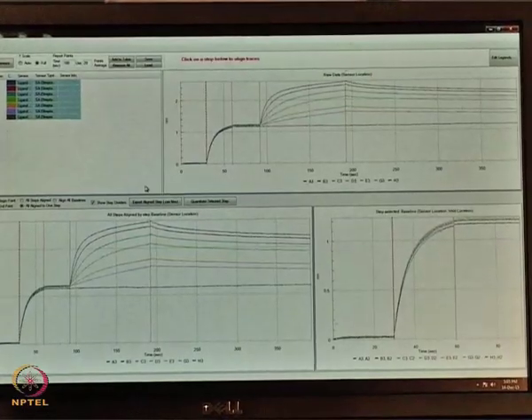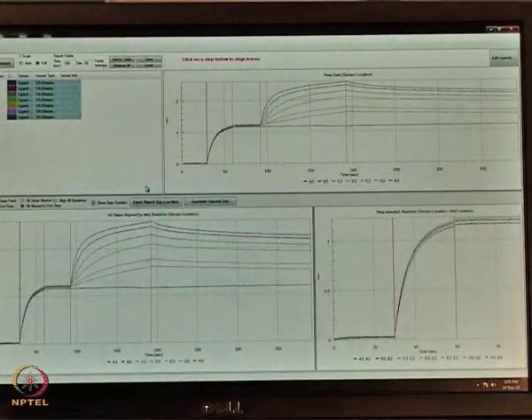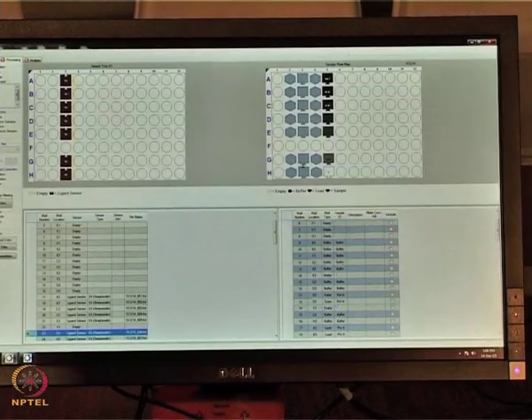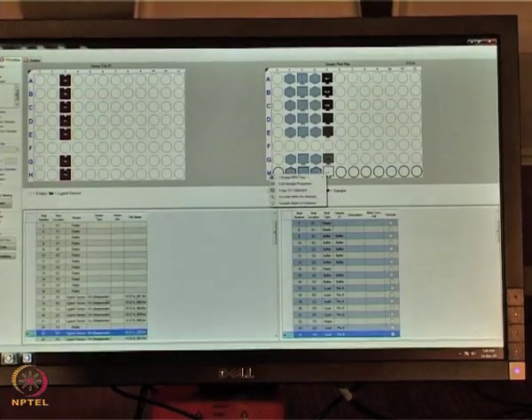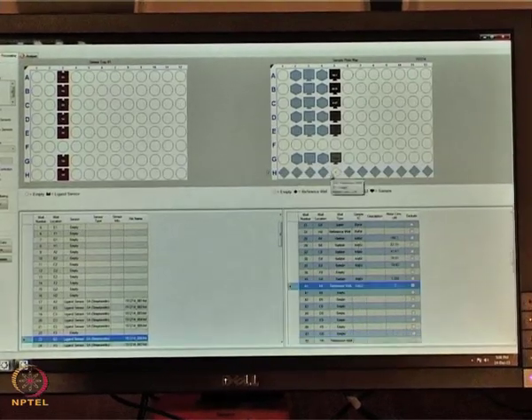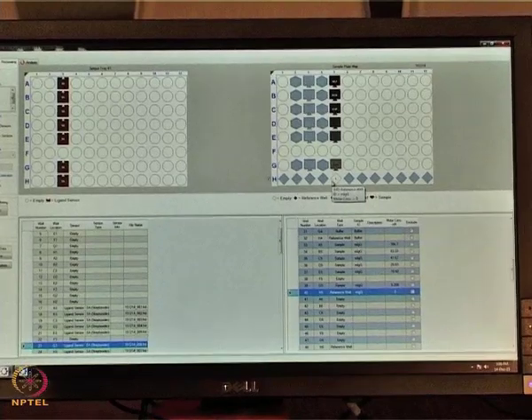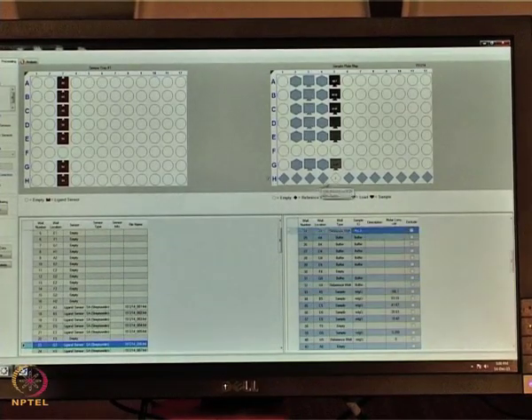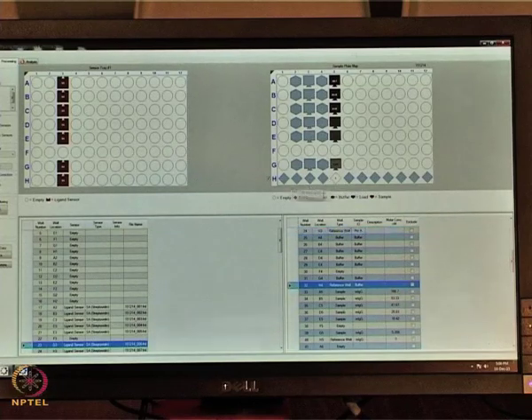In the processing tab, we will see the raw data. What we are doing is subtracting. In one of the columns I had put a zero concentration. This column I will change to the reference well. This is the zero concentration, because some of the artifacts from the buffer we can subtract from the data. That's why I am going for the reference subtraction.